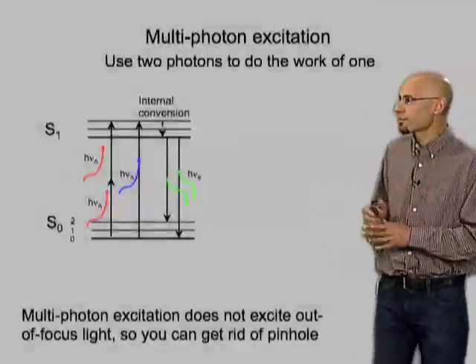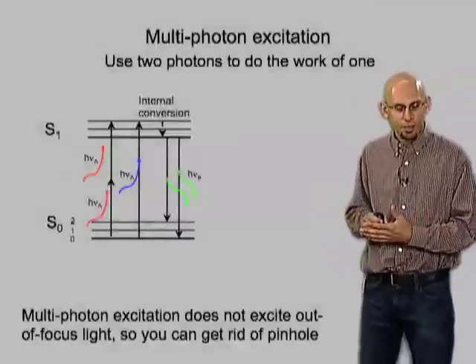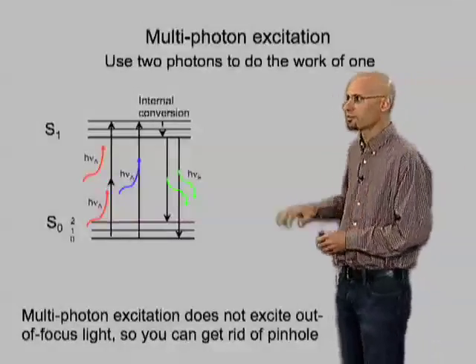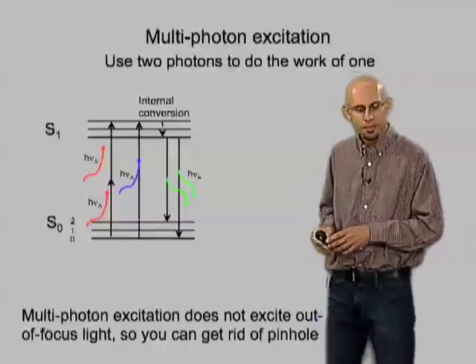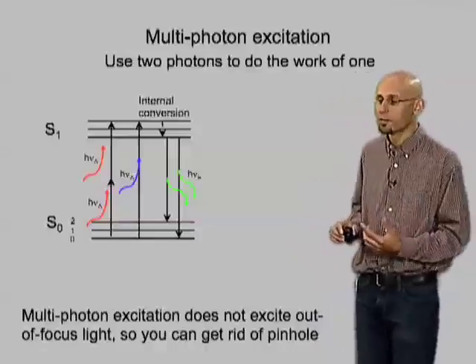And finally, I just want to mention one other technique in this family of optical sectioning approaches, and this is called two-photon microscopy, or more generally, multi-photon microscopy. And the idea here is that you can use two photons to do the work of one.